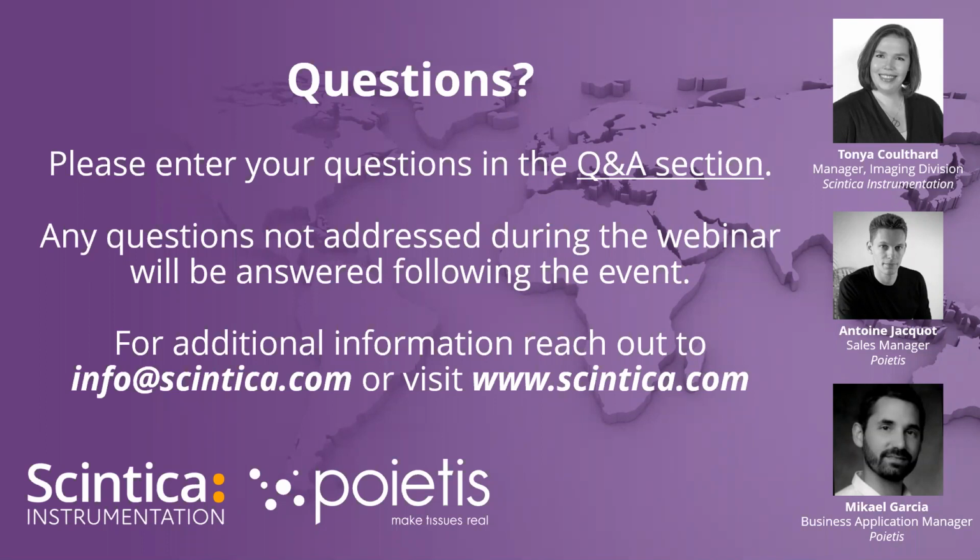Further to that, Antoine, perhaps you want to address this: can laser-assisted bioprinting be used to make a thick tissue? I would say with that, you're using multiple layers and multiple substrates to build up and implant cells at different points. But if you wanted to expand on that.